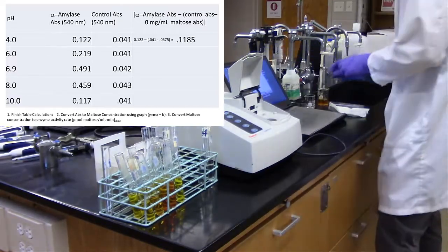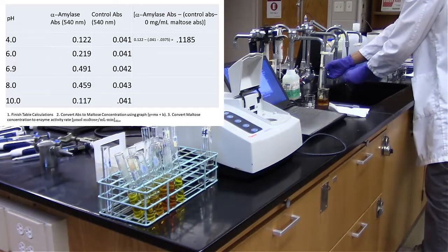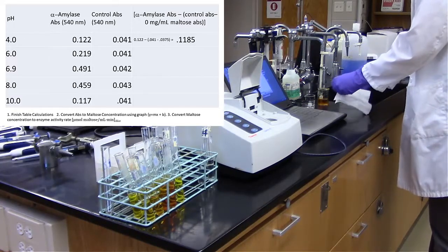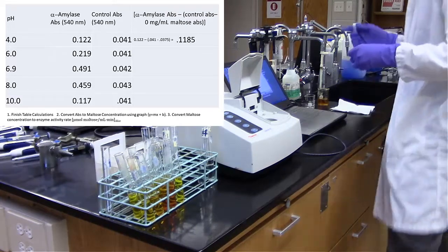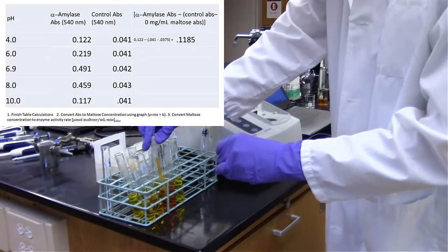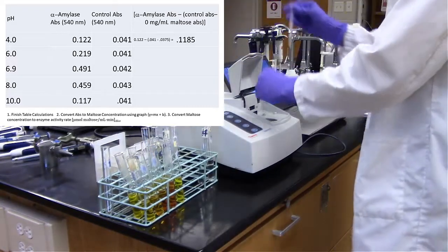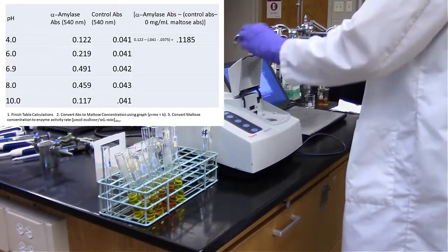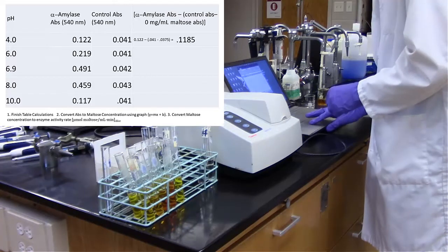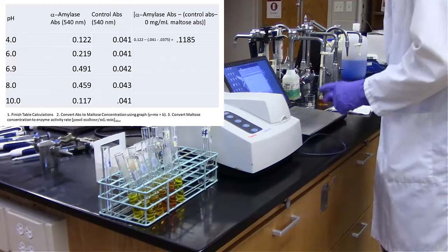I think you have seen the Genesis Spec 20 plenty from here, and that is all of the data you need for the experiment. Again, this is 2 sets of experiments combined, so experiment 6 and experiment 7 have been combined into one. There is one lab report due for the set of experiments. Essentially think of it all as one experiment. The guidelines for the lab report will be posted, and that link will be available on Canvas.